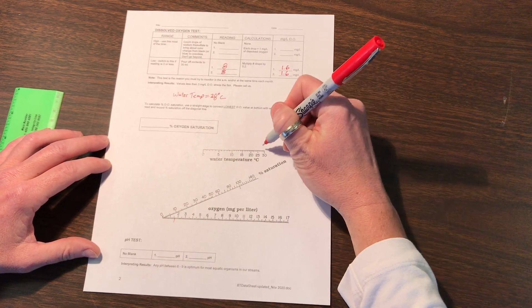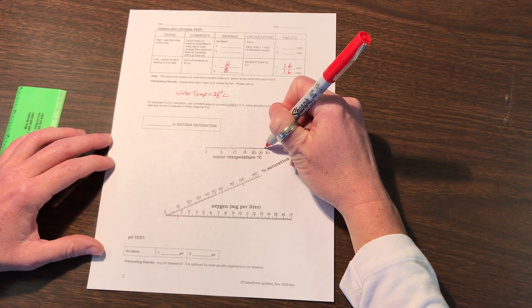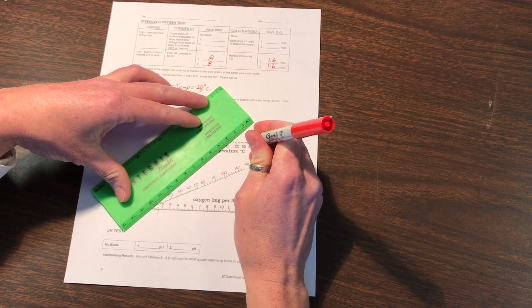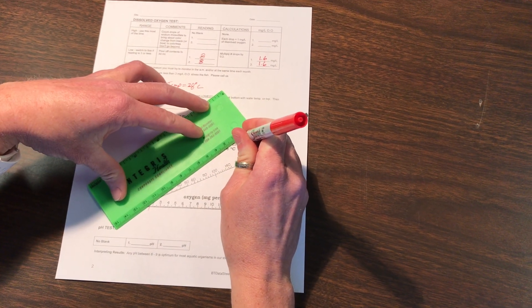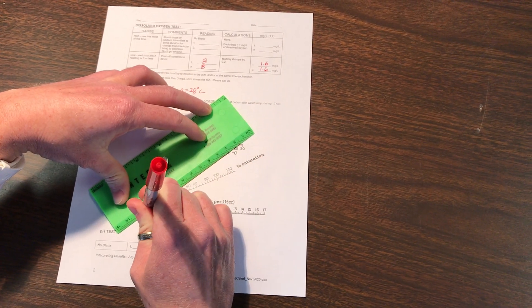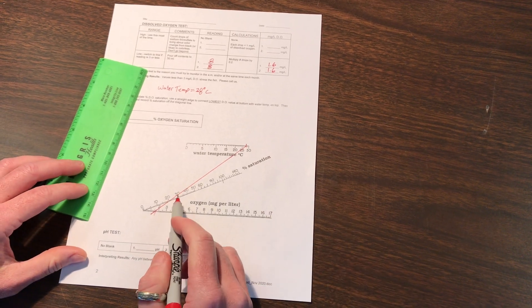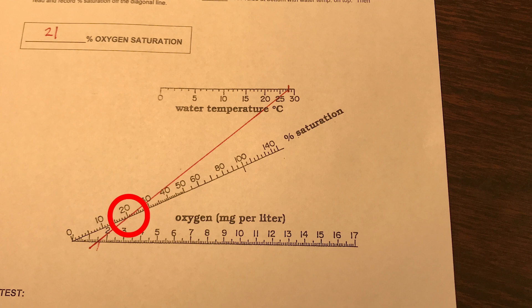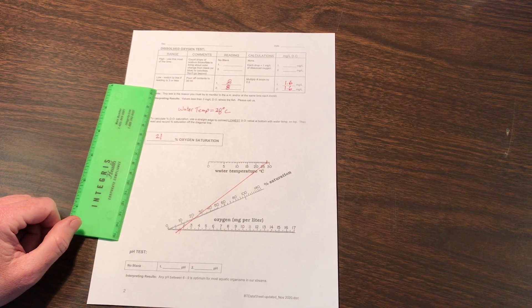Use our trusty ruler, connect our marks. Roughly where it crosses the line, it's looking about 21% for the oxygen saturation. Where my red marker line crosses here, it's about 21%. Put that in there, and that roughly calculates our percent oxygen saturation.